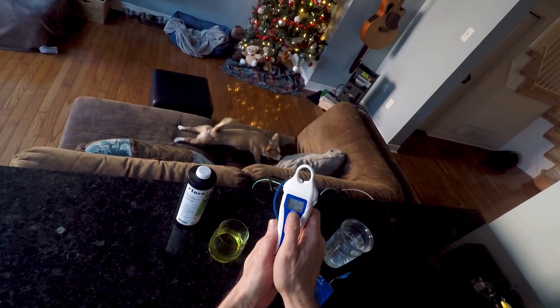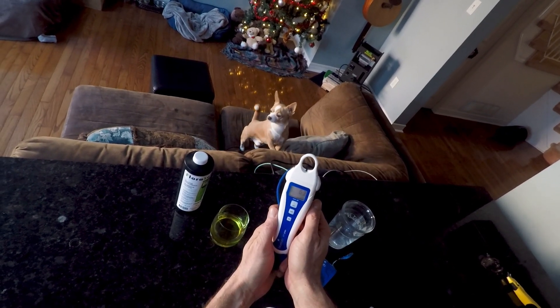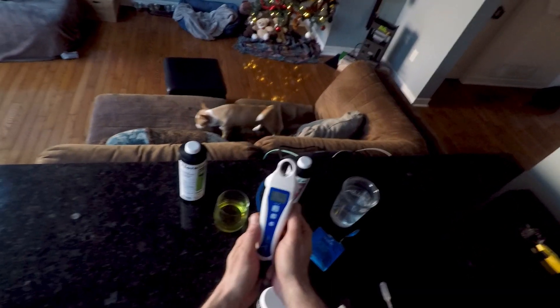And we are done. Recalibrated. Can you see that beautiful check mark right there? We are good to go. So that is how you recalibrate and clean the Bluelab pH pen.